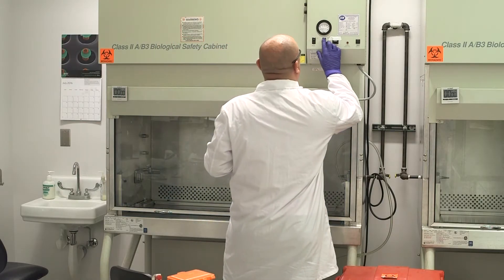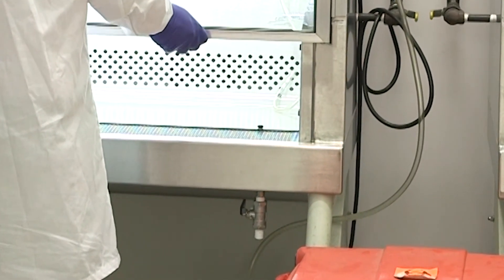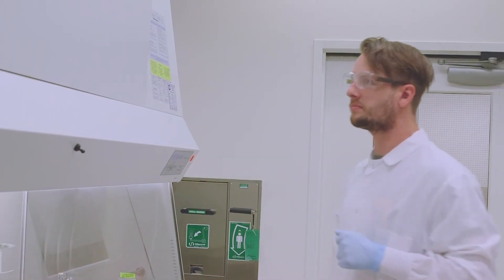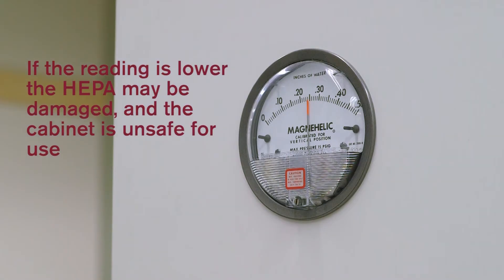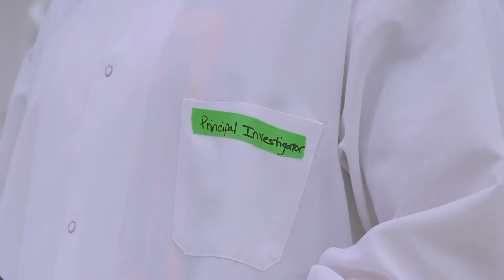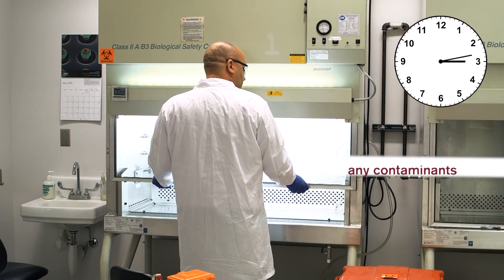If the UV light is on, turn it off, then turn on the cabinet blower and light. Verify underneath the biosafety cabinet that the drain valve is closed. Check the certification sticker and ensure the biosafety cabinet has been certified within the last year. Check the pressure value reading on the magna-helic gauge and compare it with what is recorded on the certification tag. If the reading is equal or within 10% higher, the cabinet is safe to use. If the reading is lower, the HEPA filter might be damaged and the cabinet is unsafe to use. If the reading is noticeably higher, the HEPA filter may require service. Allow the blower to run for 15 minutes before beginning work to allow the air to complete a full cycle and purge any contaminants.